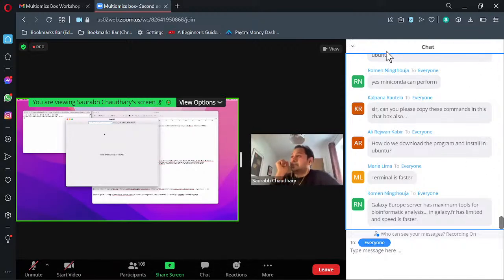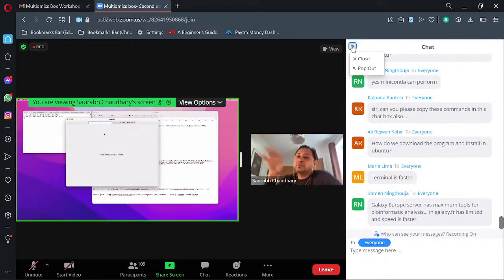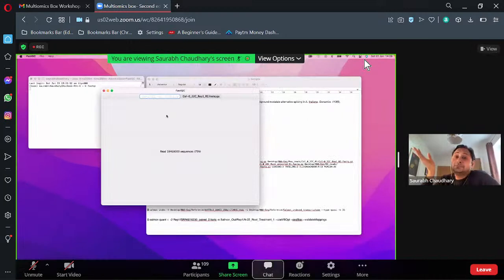All right. If we talk about quality control, you can use any tool you are comfortable with, as long as your data is good for performing the analysis. There is no such thing as which one is better for quality control, Trimmomatic, Trim Galore or fastp, whatever you are using, MultiQC.